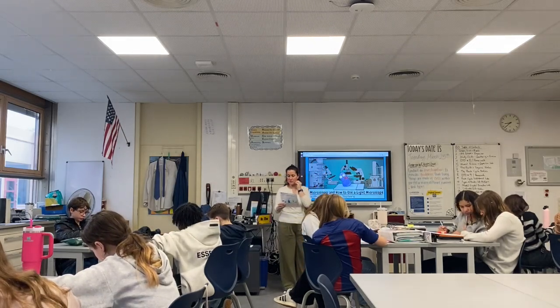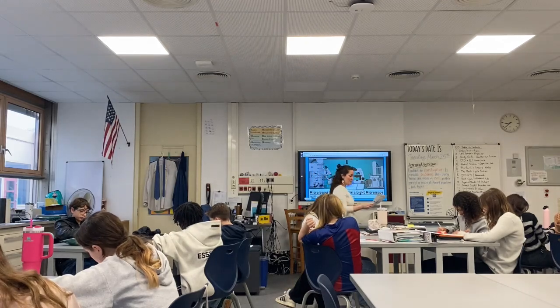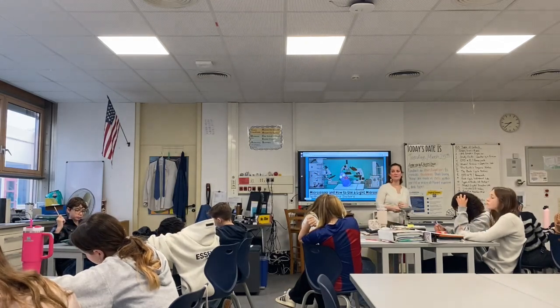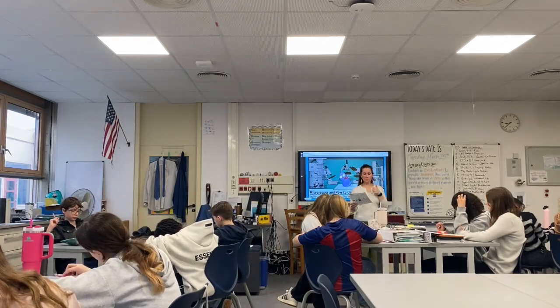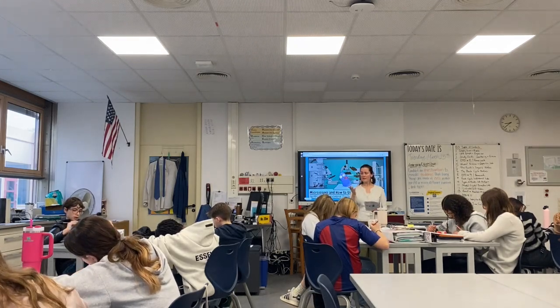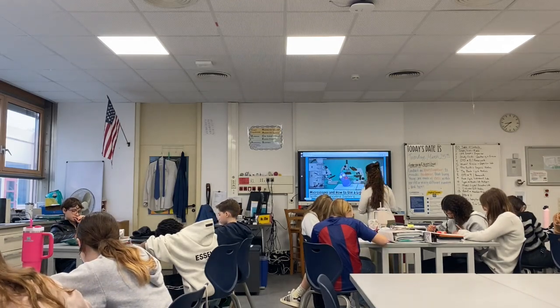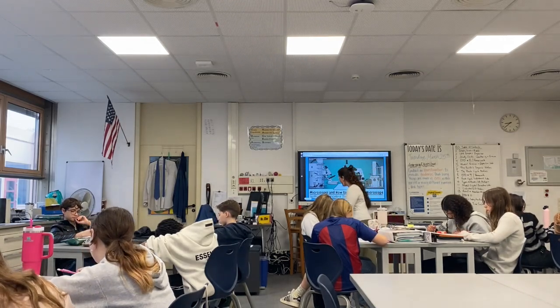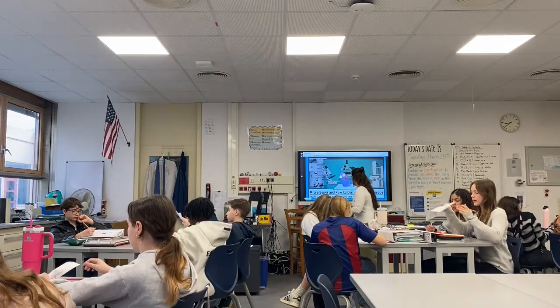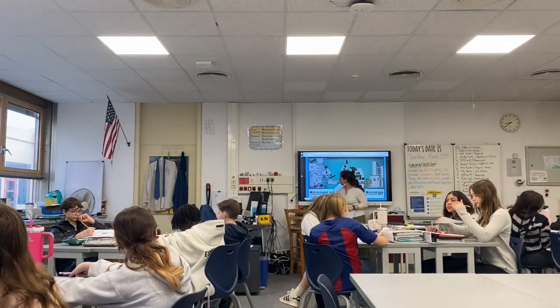The light microscope drawn above is also known as a compound microscope as it has more than one set of lenses. True. And then oil immersion can be used at all magnification levels. False. That's right. Only at the highest. Okay, so you guys can put that paper away. And let's look at our lab.